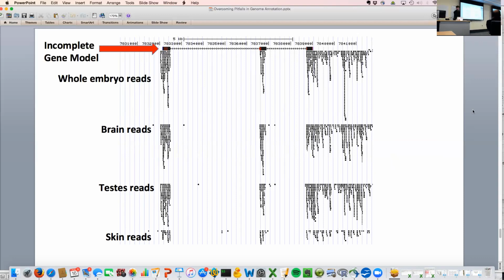It depends partly on, like Wes mentioned earlier, this varies from gene to gene. Some genes are going to be really bad. Other genes are going to be pretty close to right. So it kind of depends. It also depends on how highly expressed the genes are. If you have a lowly expressed gene that you care about, like transcription factors, you don't want to be throwing out reads. But if your gene is expressed pretty highly, like this one is, you will still be able to quantify it with that many reads mapping to the exon.